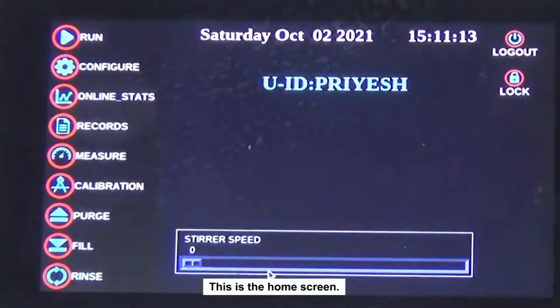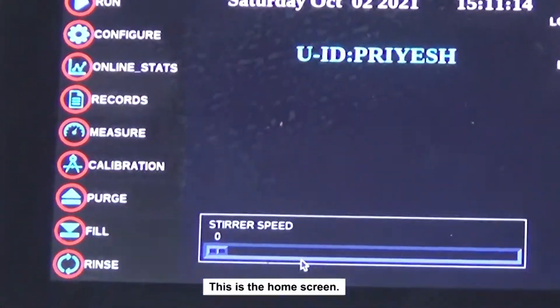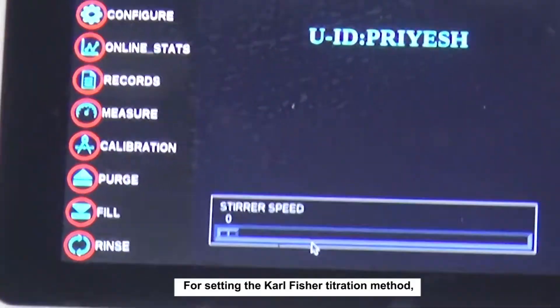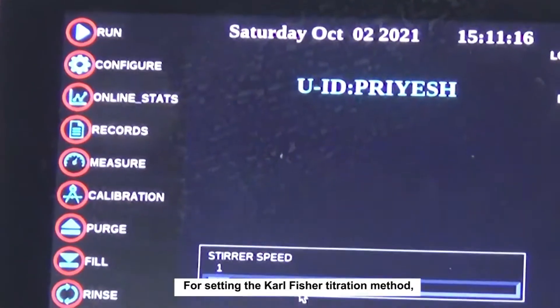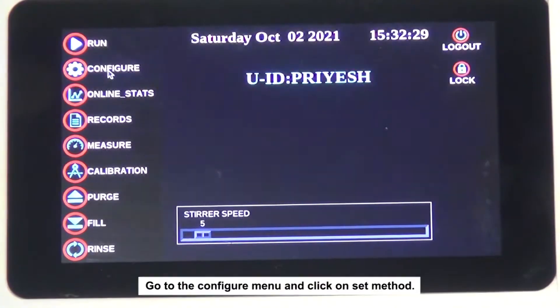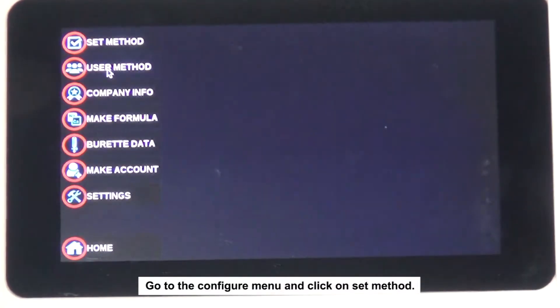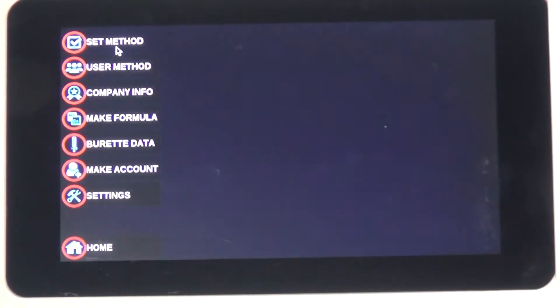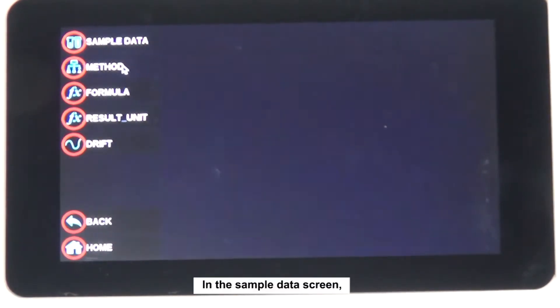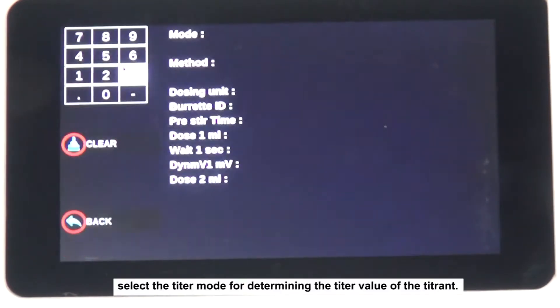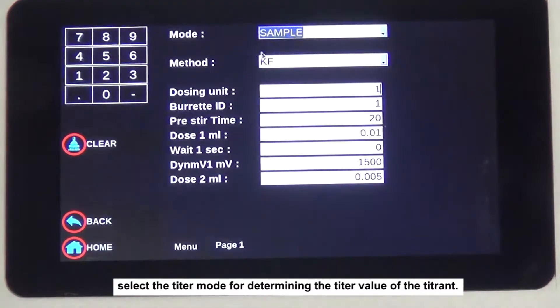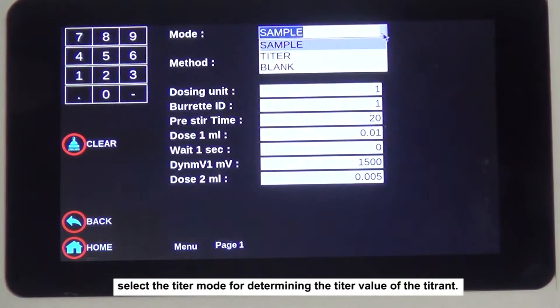This is the home screen. To set the Karl Fischer titration method, go to the Configure menu and click on Set Method. In the Sample Data screen, select the Titer mode for determining the titer value of the titrant.